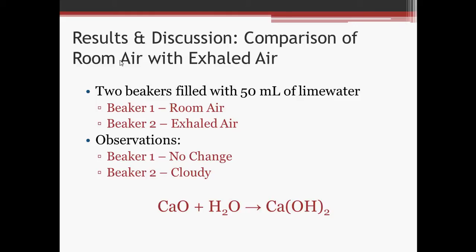After 2 minutes of bubbling room air through the first beaker, no change was observed. After only about 28 seconds of bubbling exhaled air through the second beaker, it was observed that the lime water had become cloudy. This suggests that exhaled air has a higher carbon dioxide content than room air. The calcium hydroxide in the lime water reacted with the carbon dioxide in the exhaled air to form calcium carbonate, turning the liquid from clear to cloudy.